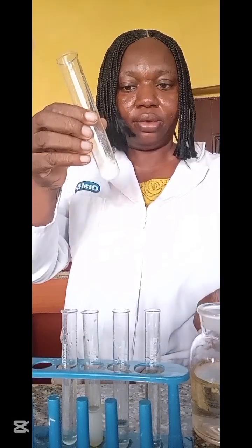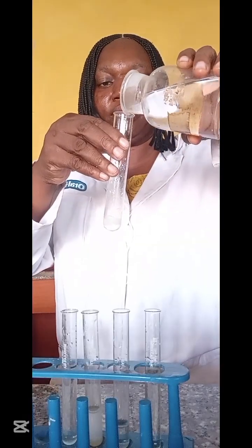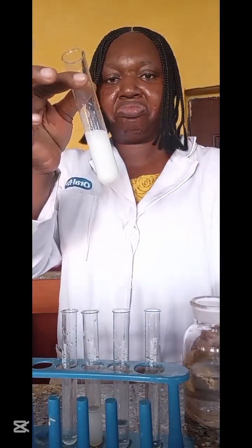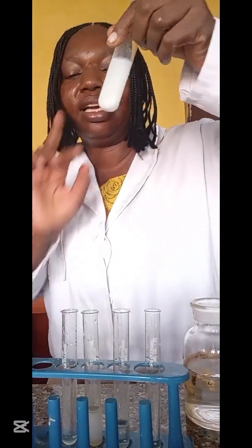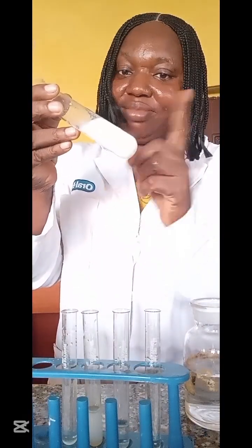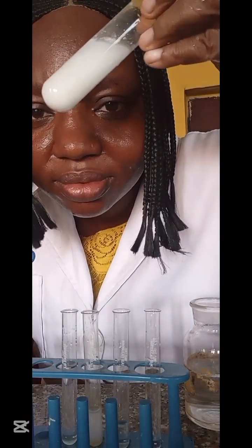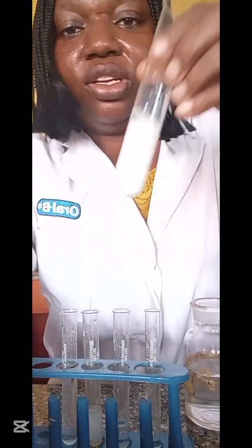So, in excess ammonia, in drops and in excess, lead salt does not dissolve in ammonia. You see? Look at it. Does not dissolve.